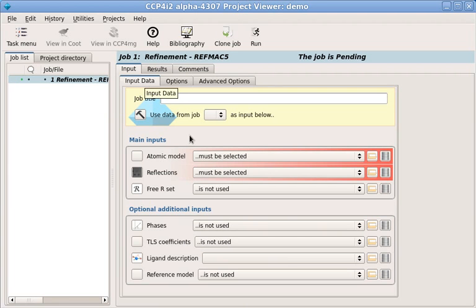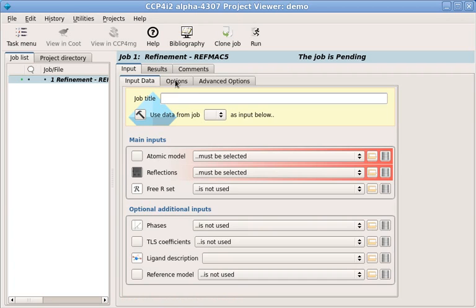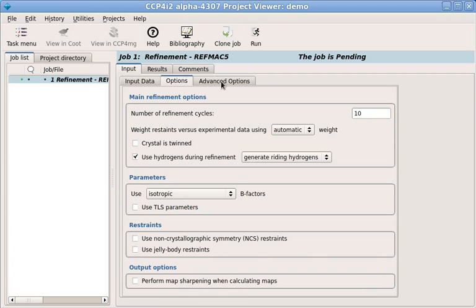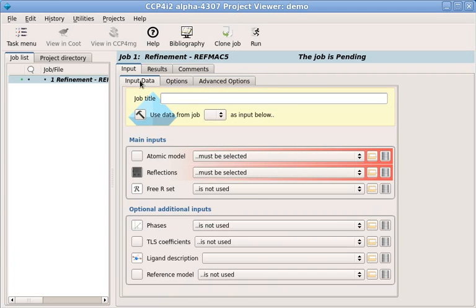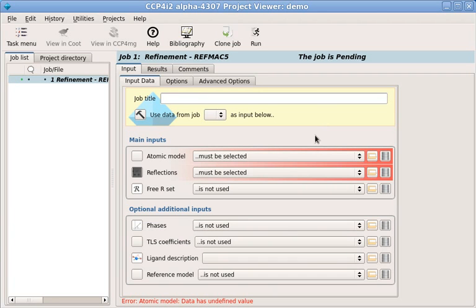The input data tab is shown on the right. This is where you select the inputs for the task. Other tabs have advanced options. Options which are highlighted in red are the ones which you have to fill out. For refinement, we need a model and some structure factors.